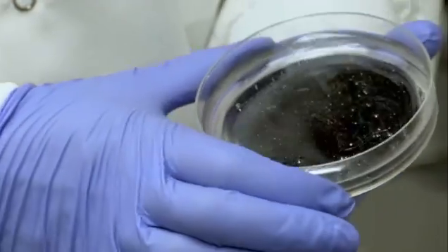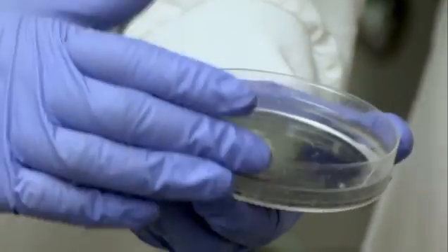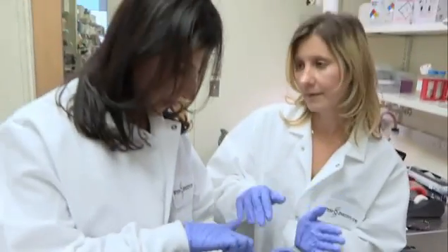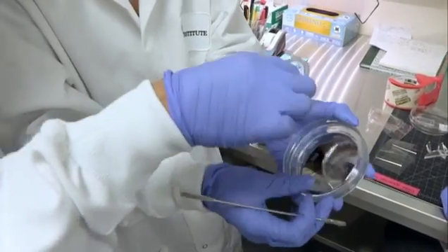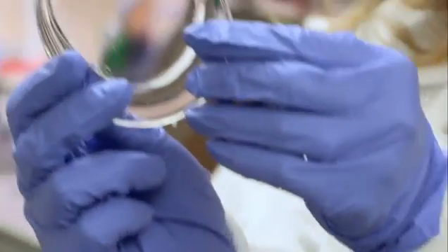This is a mould for a gut on a chip. This is the mould that you made and then you pour the silicon in. Is that the silicon? And that will create the channels where we put the cells.